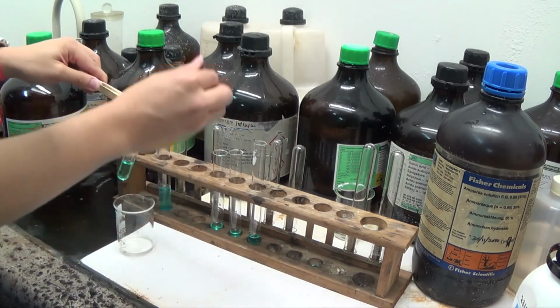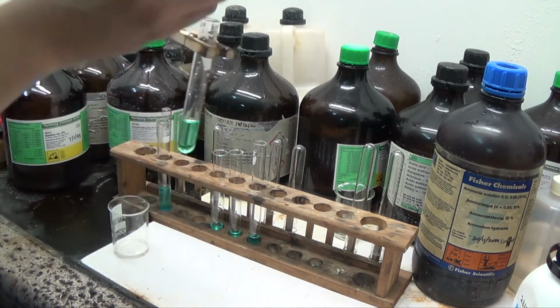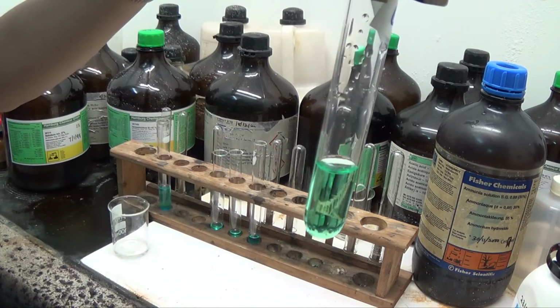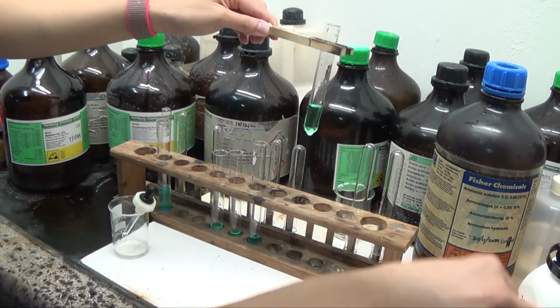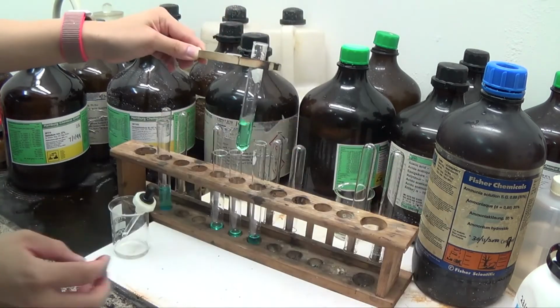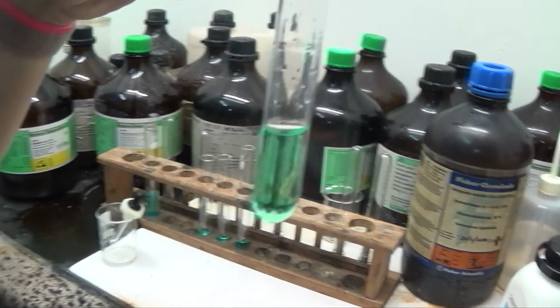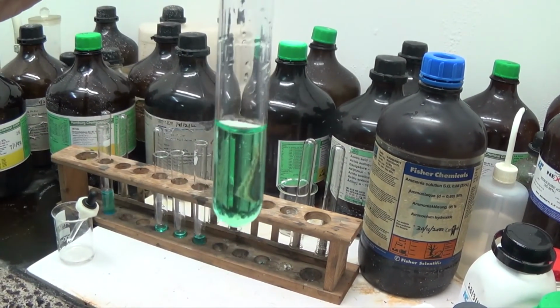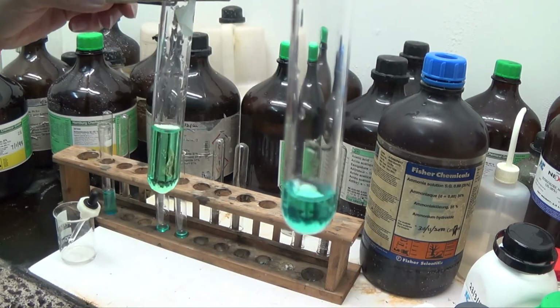I should keep on adding hydrochloric acid to it, and it will become clearer. Okay, so I hope it is kind of clear that it is going green. Alright, so this is green solution. This was the blue solution.